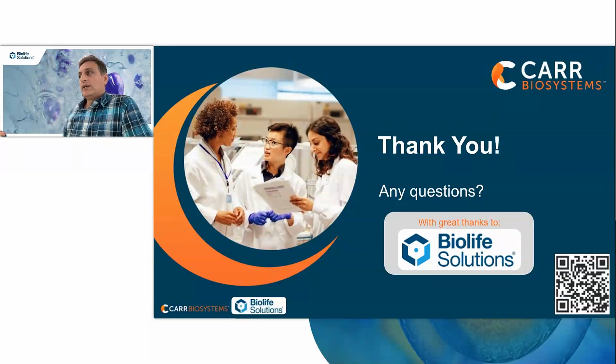As you know, platelets are activated upon exposure to cold and cryopreservation. If you have a large portion of platelets still remaining in that leukopak when it's formulated with CryoStor, when they come out of thaw, they will be activated and they can cause clumping. So I think you can eliminate a bunch of that issue upfront by upstream process development, and then you would have less of that clumping issue after thaw and continuation of the rest of the process.